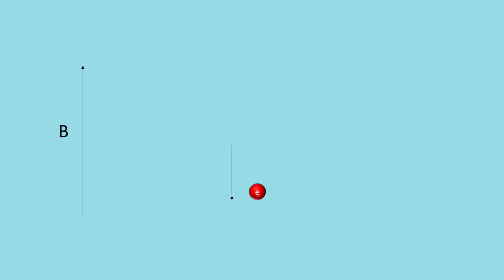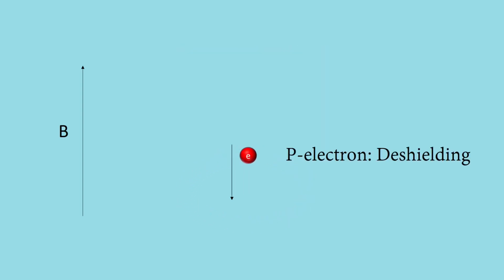For NMR, the reference is tetramethylsilane, Si(CH3)4. For s electrons in a molecule, their spherical symmetry and circulation in the applied field produce a magnetic field which opposes the applied field. This means that the applied field strength must be increased for a nucleus to absorb at its transition frequency. This upfield shift is termed the diamagnetic shift.